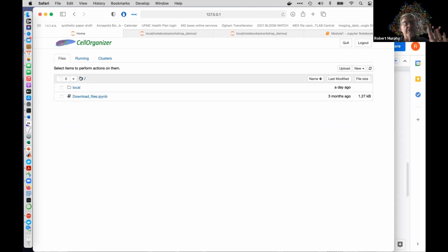Yeah, if you have a connection to a dead server, nothing will work. This page won't work if there's not a corresponding Docker server running it. Okay. Yeah, now I see it. Someone posted something, Murphy Lab Cell running. Is that the one? I see it in Docker now. Yeah, you should. Do you see this page?